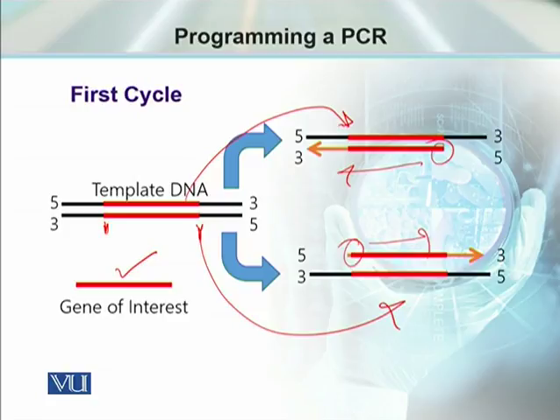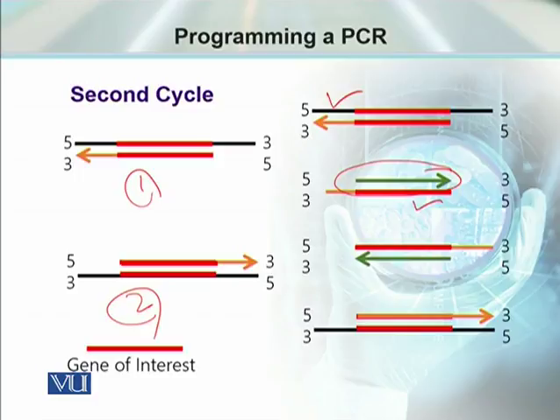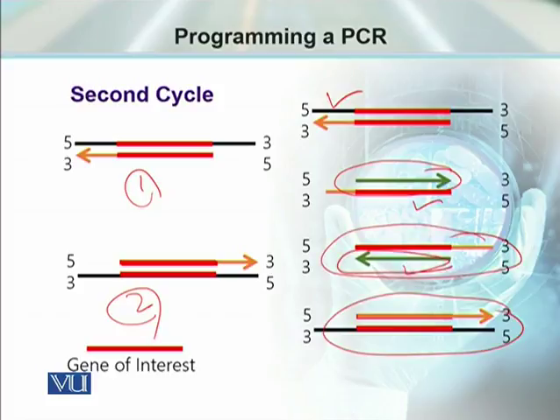But towards the end of the first cycle, the DNA will keep on extending because we already have the template available. By the time the second cycle is going to start, by increase in temperature, these two daughter molecules or newly synthesized DNA molecules are going to denature again. Now look at this picture. This is the first molecule, this one is the second molecule. Again, denaturation is going to happen. This is the parental strand here, this is the parental strand here, and the new strands are synthesized. In this picture, you can see still one of the strands is longer than the originally required DNA fragment.